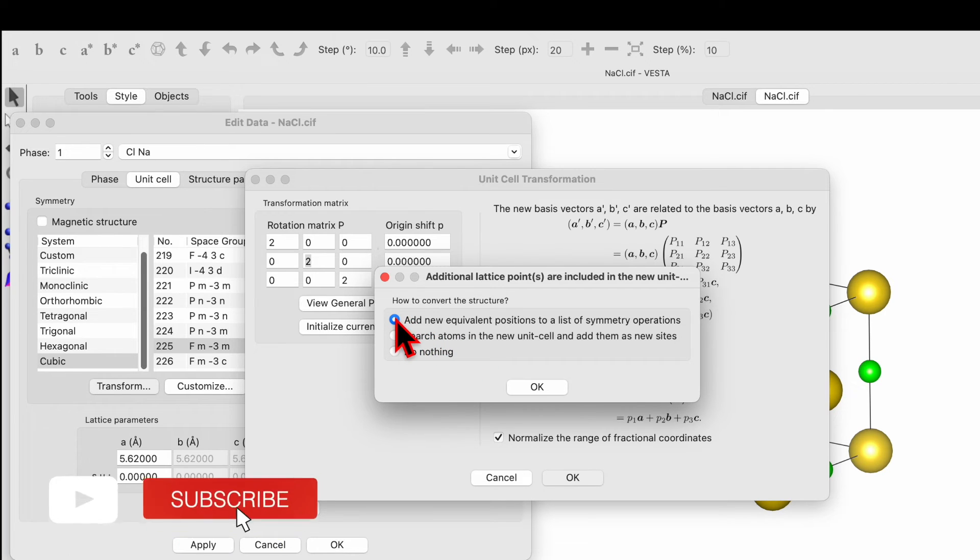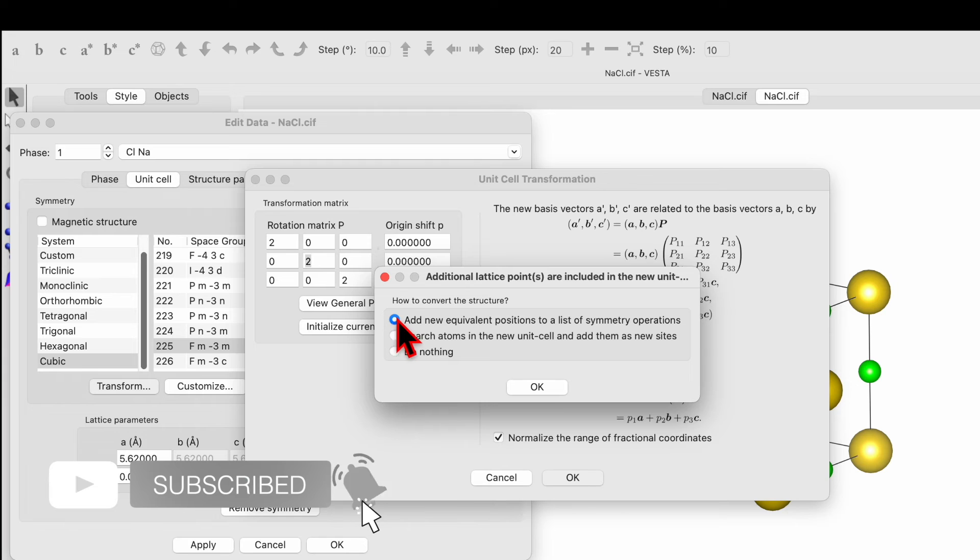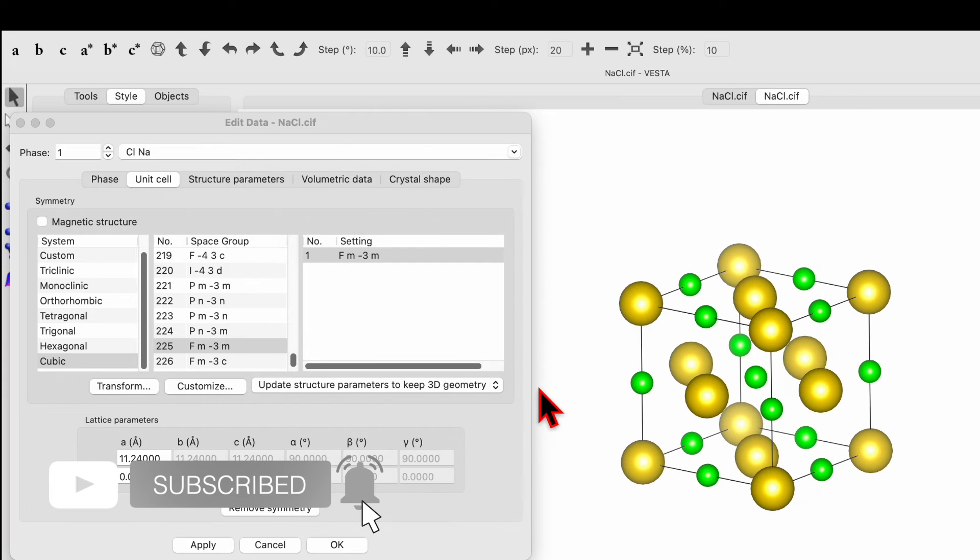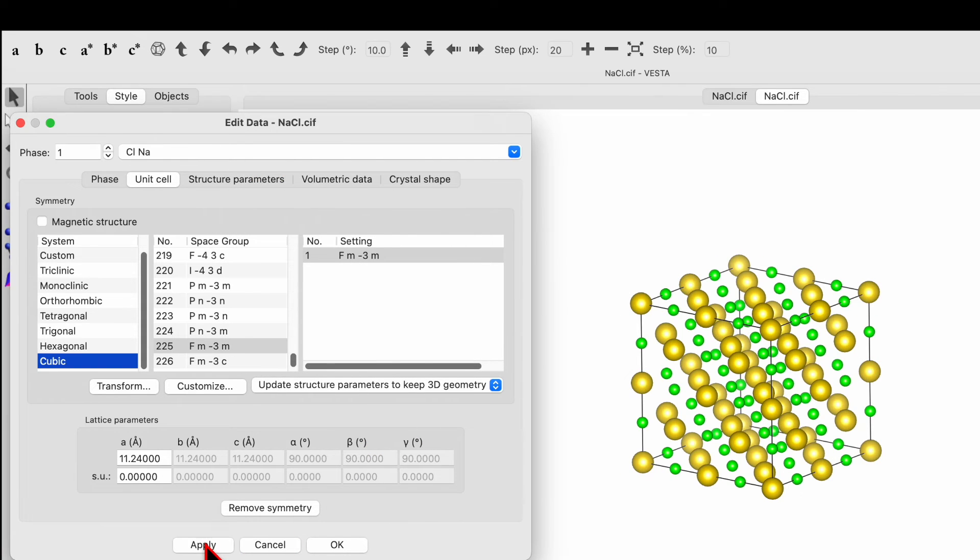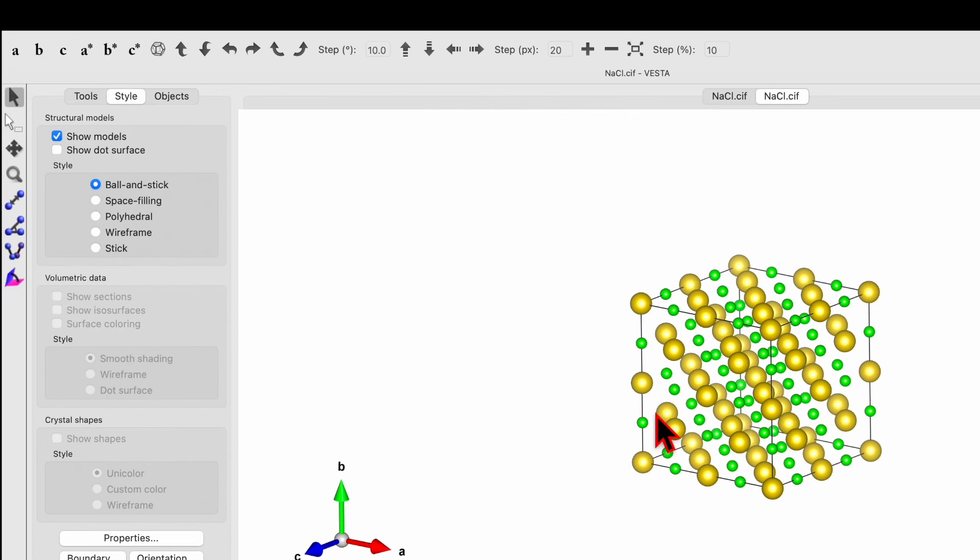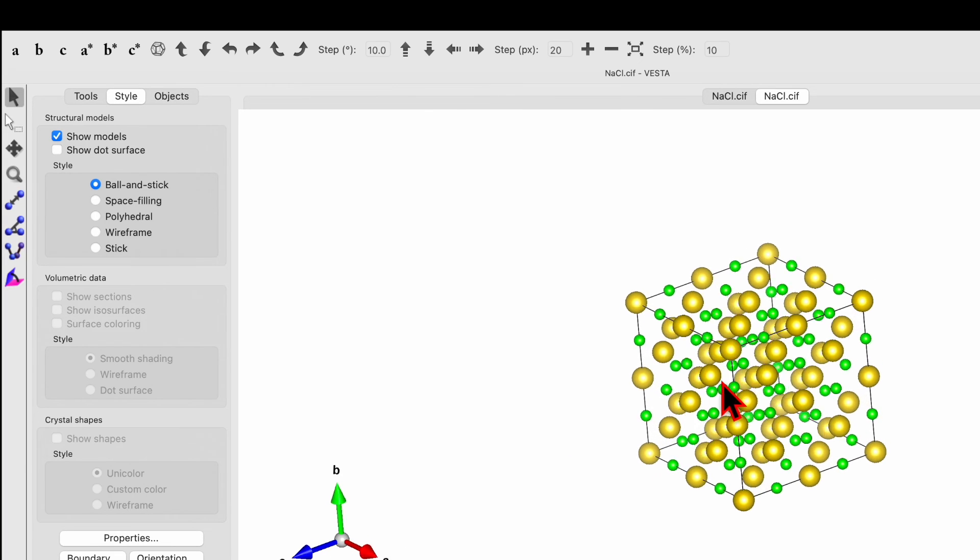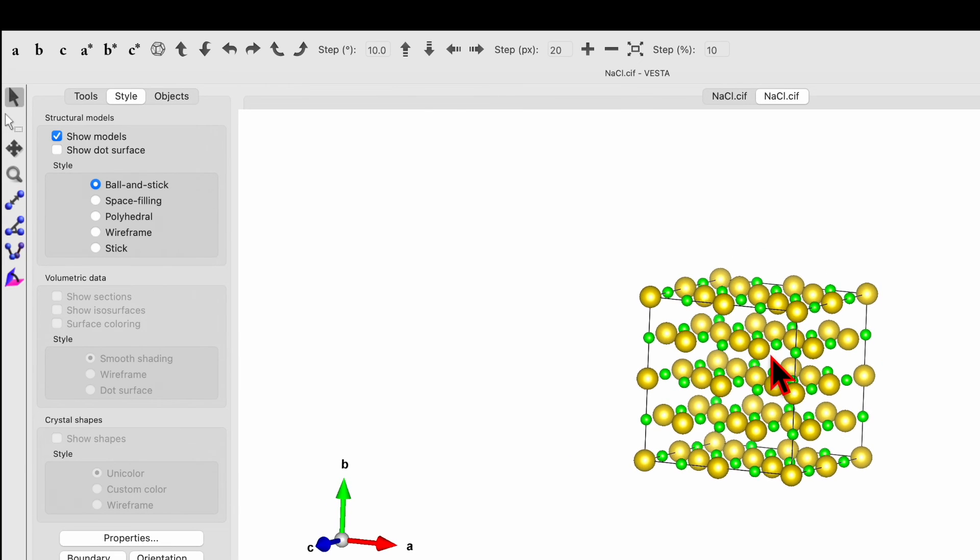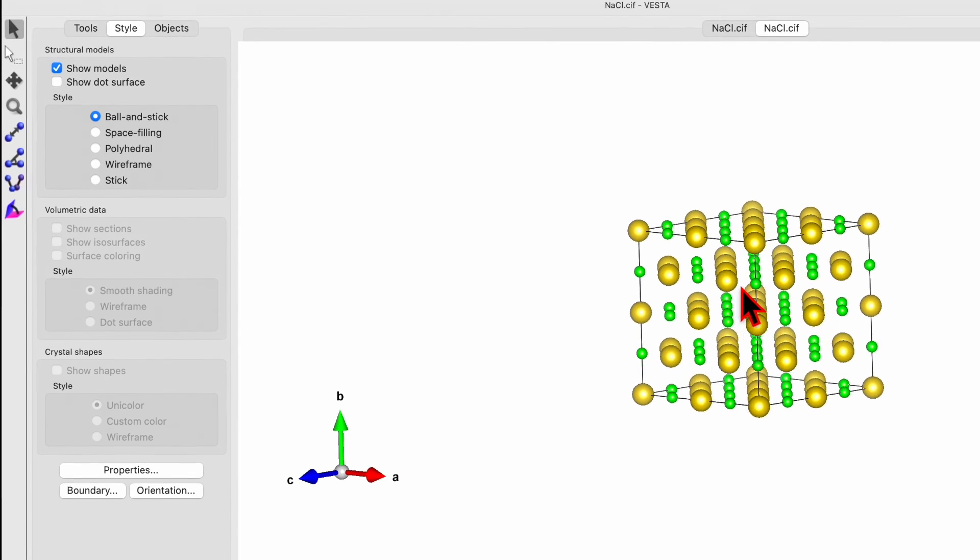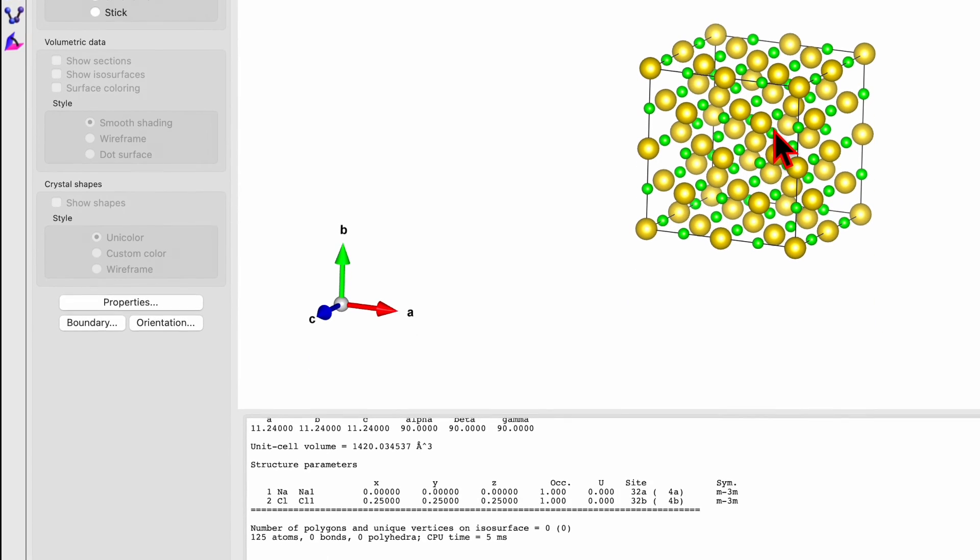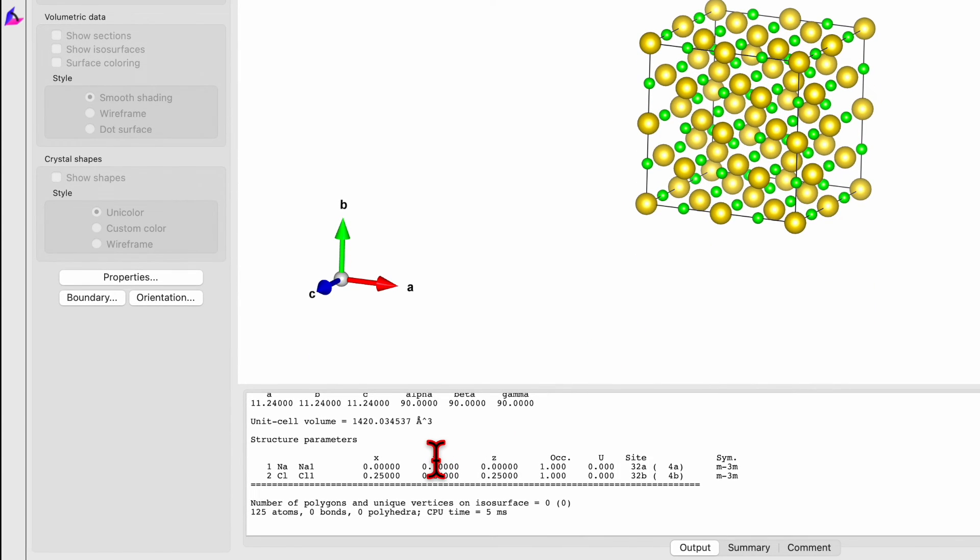Click ok and then click on the apply button. Okay, so now you can see the unit cell has been transformed from a single unit cell to a supercell. Okay, in the bottom.